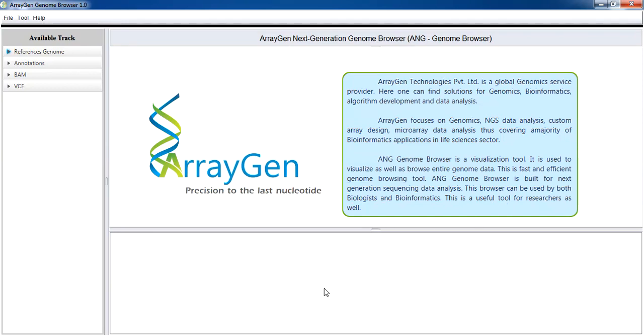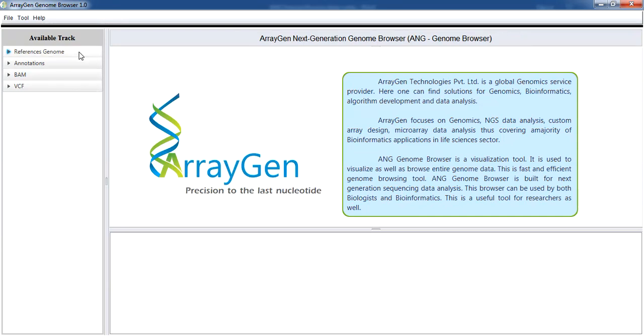Browser mainly has three windows. The right side upper window is for sequence visualization where the variations in the sample BAM file can be seen with respect to the reference genome. The bottom window is for viewing VCF file in table format.